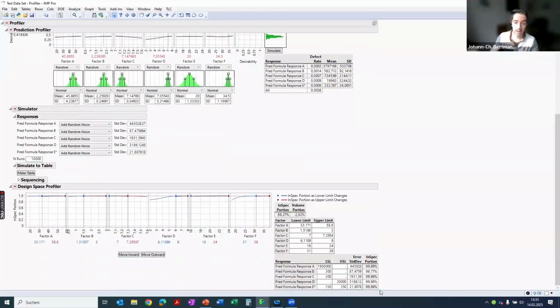So very nice. And finally, it's of course also very important and necessary to validate these limits with the manufacturing departments, because these limits of course have to be practical within routine production, and this is then finally discussed with the manufacturing departments.